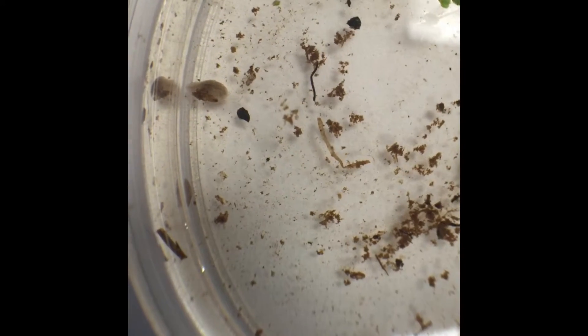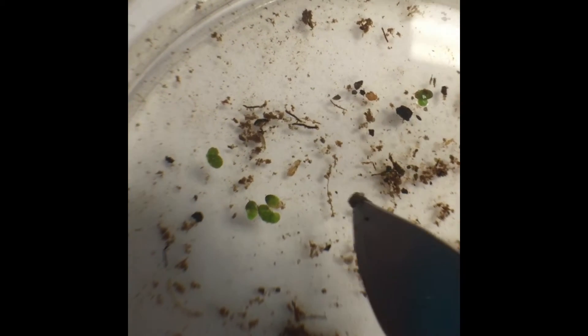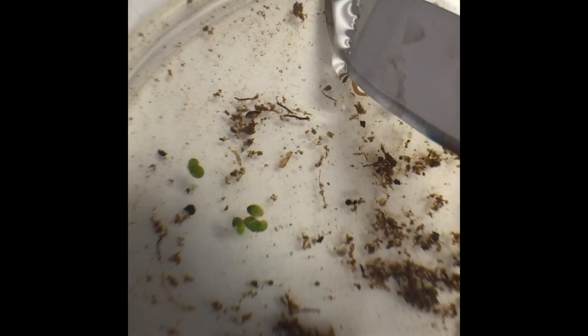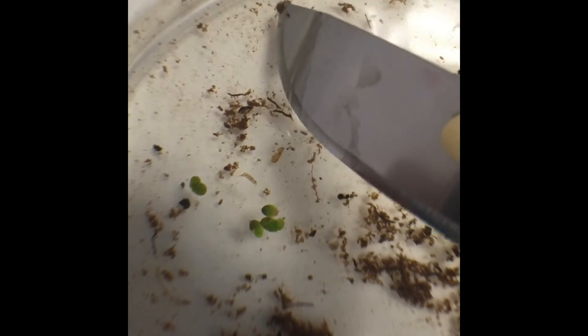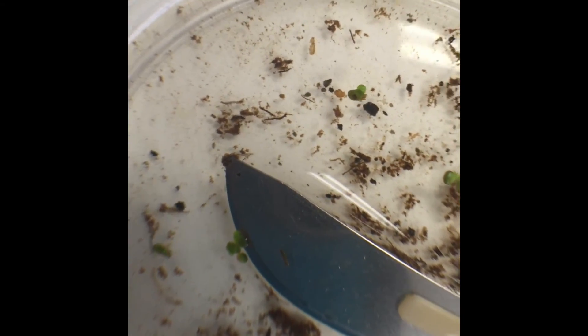They're hard to observe eating but there's the head on that one. Responds to stimuli — there's the head on another one. And that one is also responding to stimuli.